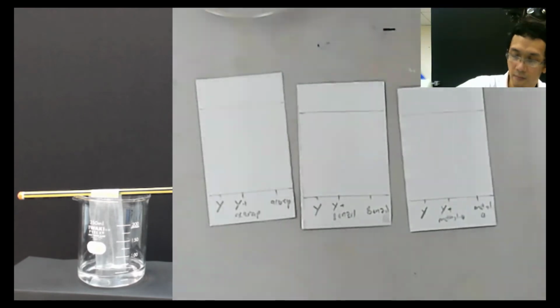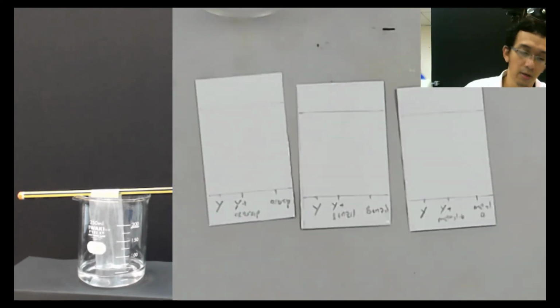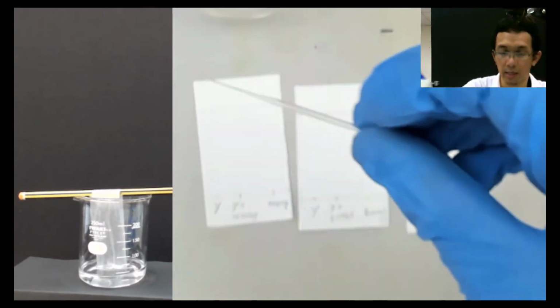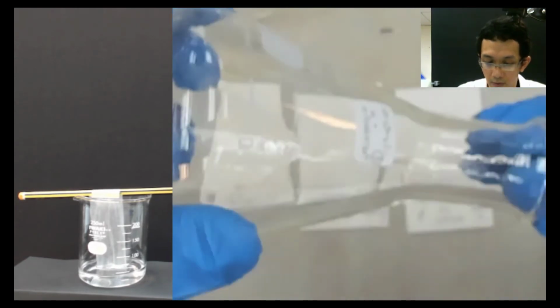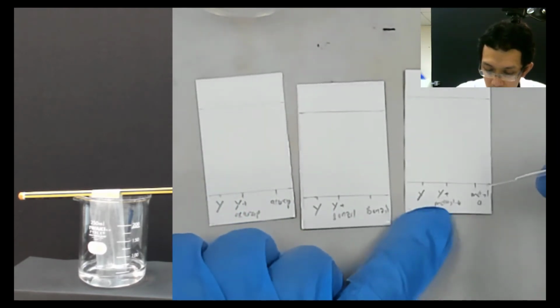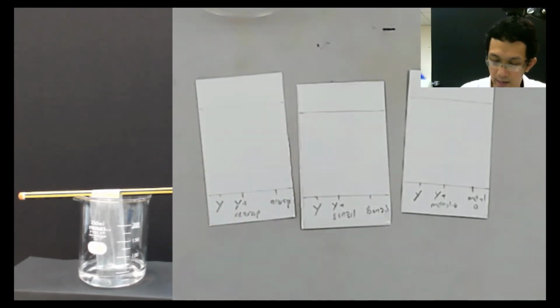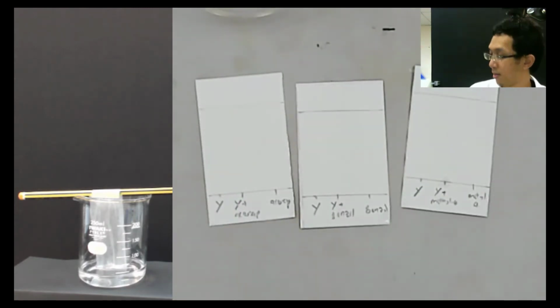And then lastly for methyl 4-nitrobenzoate. So another spotter, the last spotter, and then wait, I take it. Okay, this is another last spotter. So we take it and then do as before. Okay, so we just spot methyl here first. Okay, and then the last spot that we do is here in the middle. Okay, done.